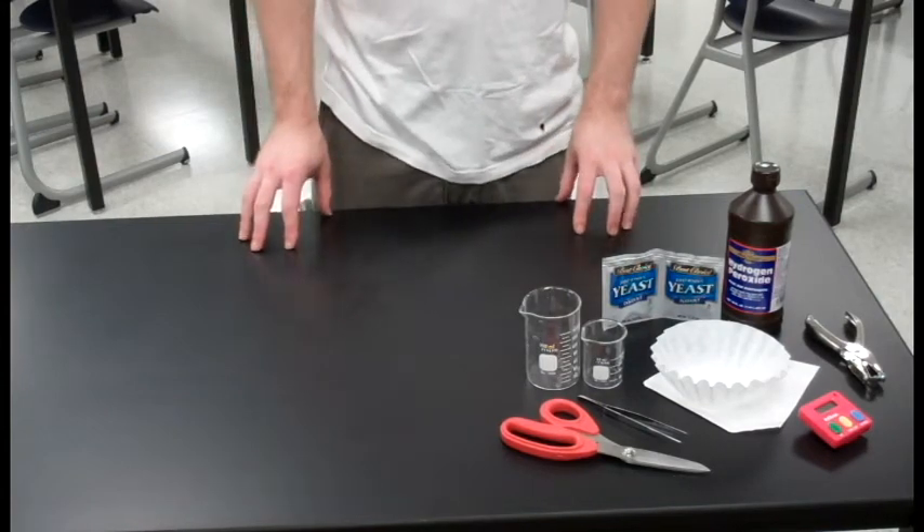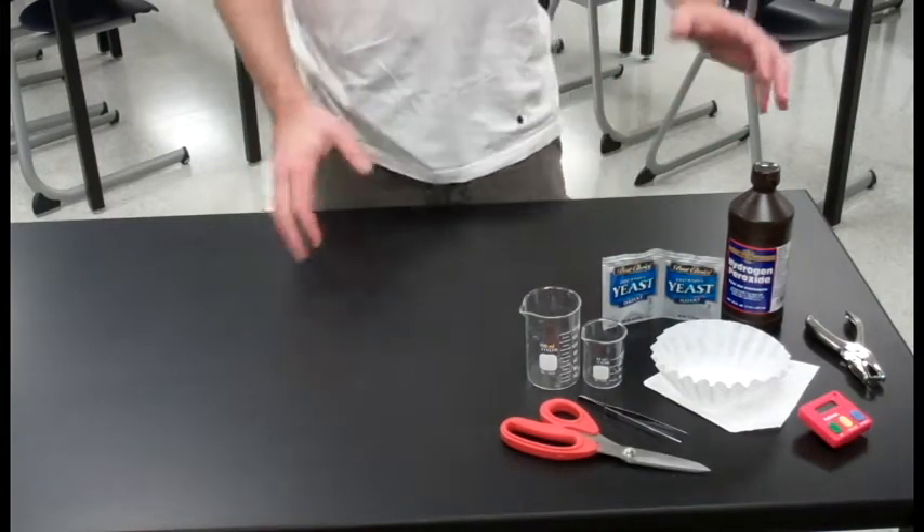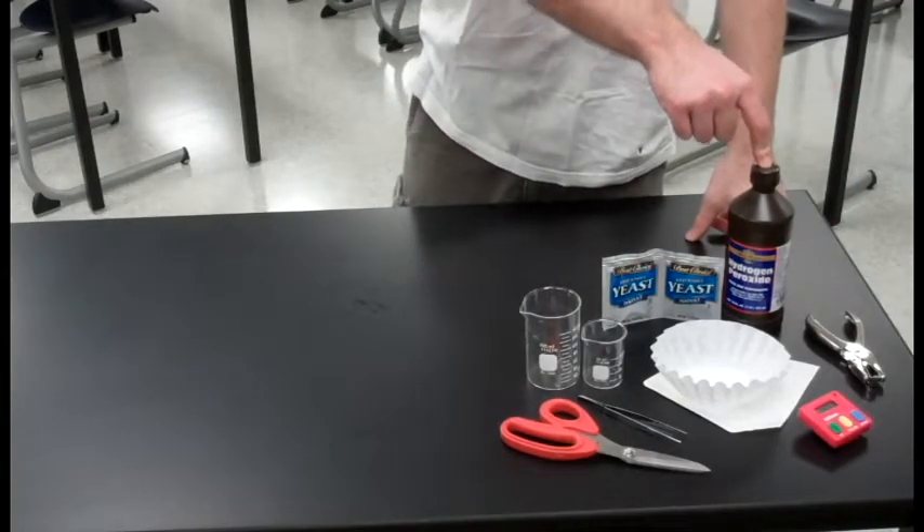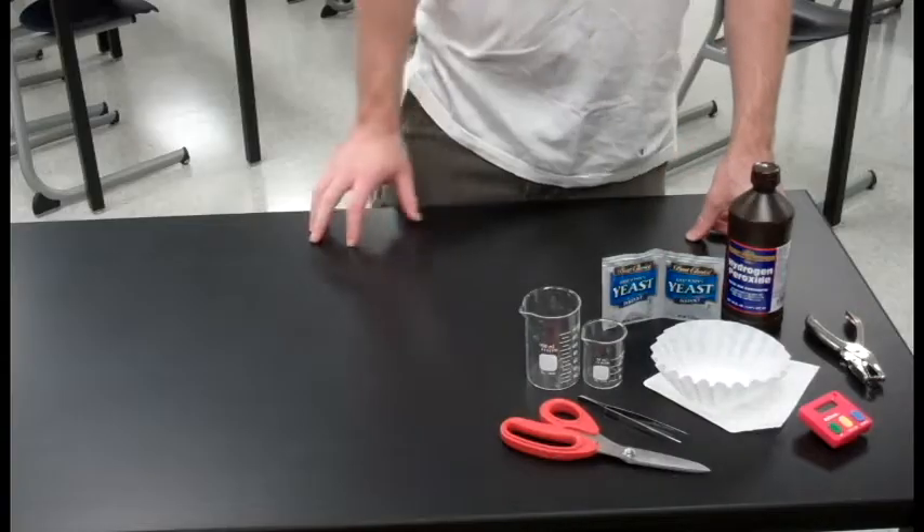Hi there, I'm Michael Ralph and today we're going to be talking about the catalase lab. We're going to be working with everything you see right here, most notably hydrogen peroxide, yeast and filter paper.